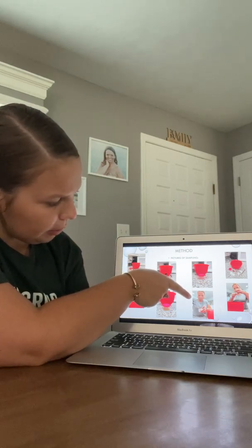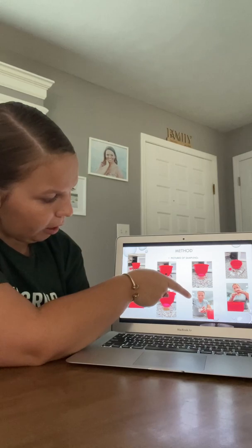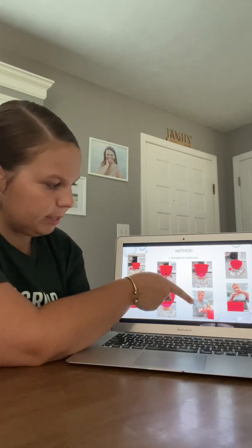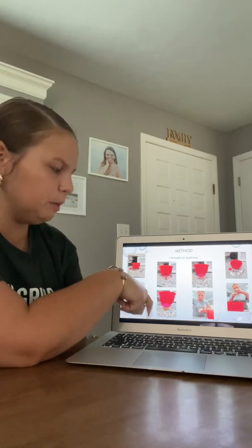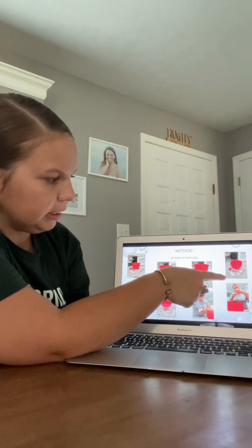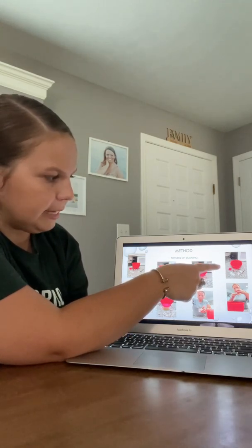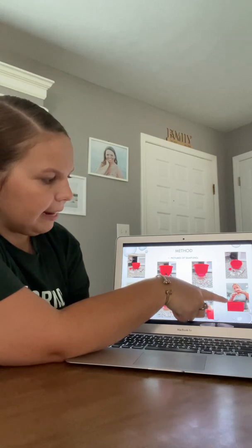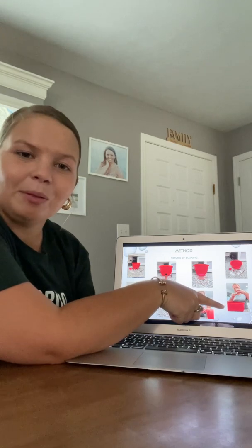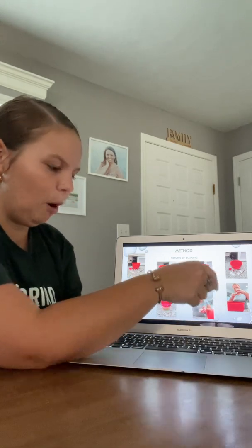This one right here below that one is me pouring 1 teaspoon of water into one of the small containers. I can't exactly remember which one I was testing. I was either testing the nitrate or the pH. This one in the top right corner, just another picture of my materials that I used. And this one in the bottom right corner is me dropping one of the dissolved oxygen tablets into the small glass vial.